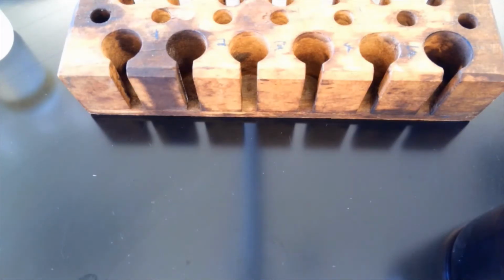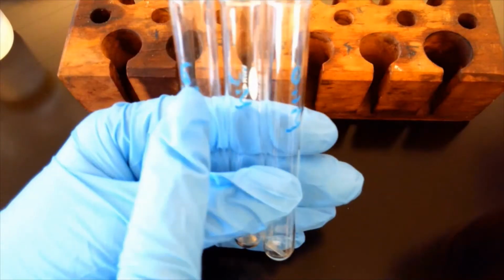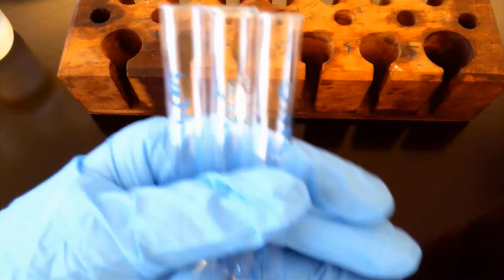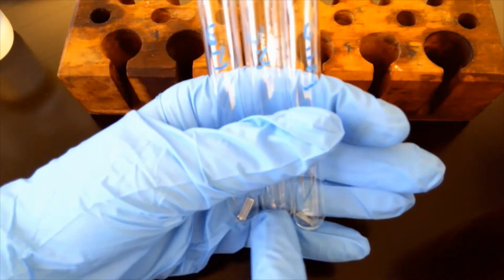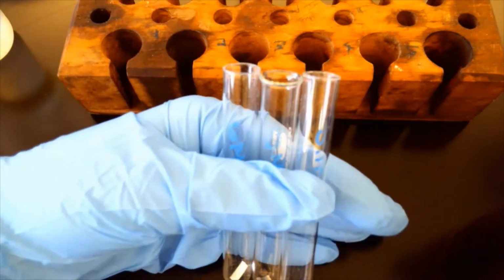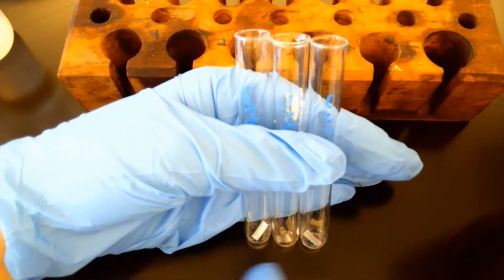So we saw what happened with the acetic acid. We're going to do the same thing now, looking at what's going to happen with 6 molar, 3 molar versus 0.1 molar. But now we're going to compare it with HCl, and we're still going to use our magnesium because that was the metal that reacted the most. So hopefully I'll hold them down here so you can see them, and we'll go.